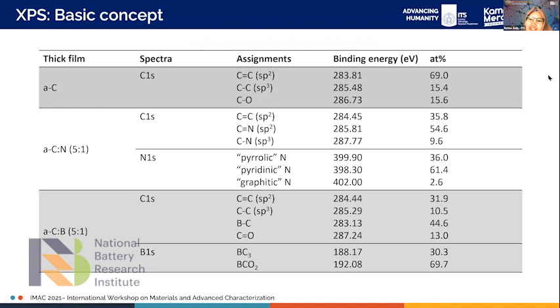Sorry for the long presentation. Okay, thank you very much. So from here, I want to say that XPS is also quite powerful to study carbon compounds, especially to identify the hybridization and bonding type. Okay, thank you very much.